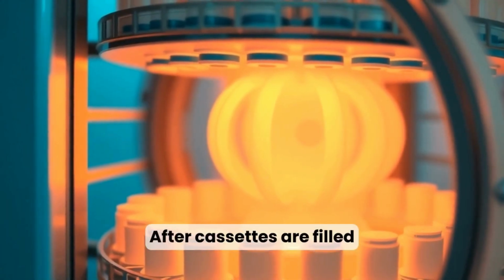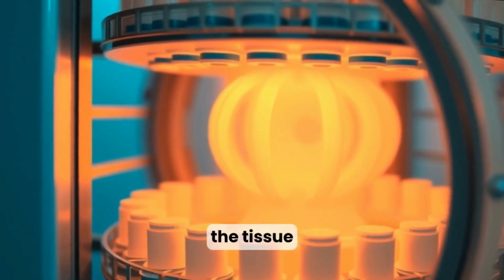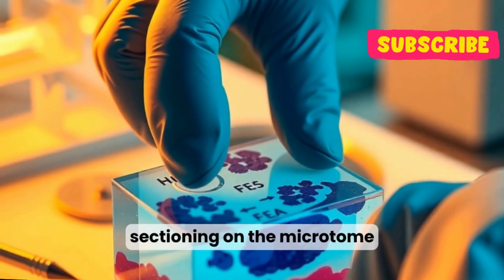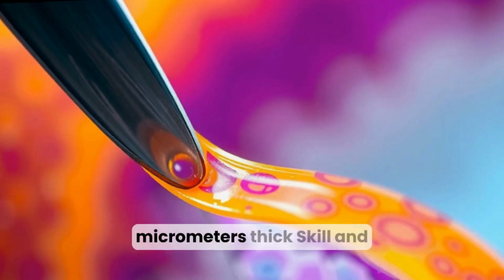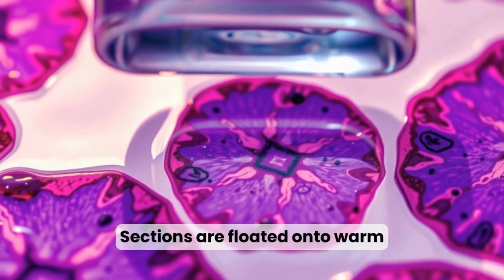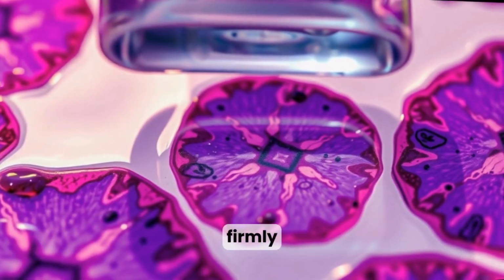After cassettes are filled, they enter the tissue processor where dehydration, clearing, and paraffin infiltration replace water in the tissue. Processed tissue is embedded in paraffin blocks to provide a firm medium for thin sectioning on the microtome. A microtome cuts sections typically 4 to 5 micrometers thick. Skill and sharp blades are essential for intact ribbons of tissue. Sections are floated onto warm water baths and mounted on glass slides, then dried before staining to adhere tissue firmly.